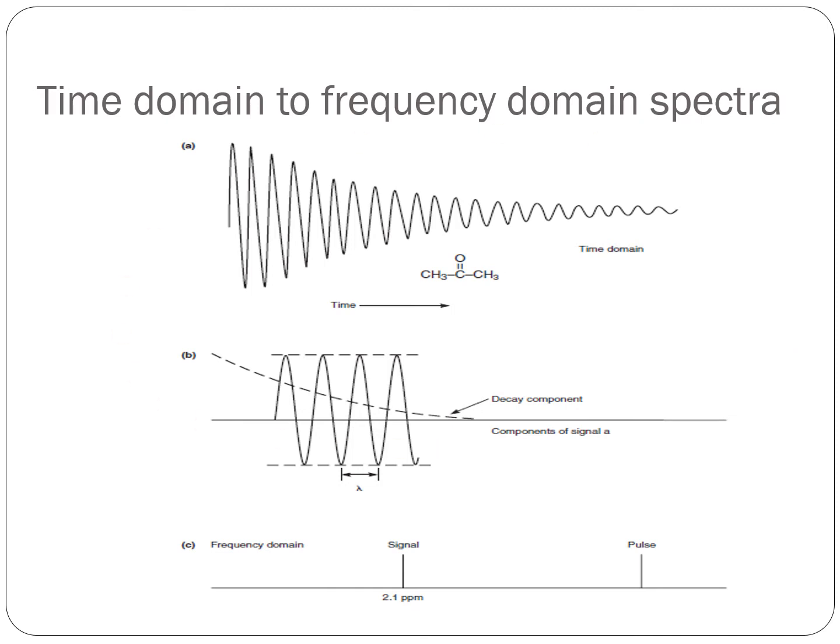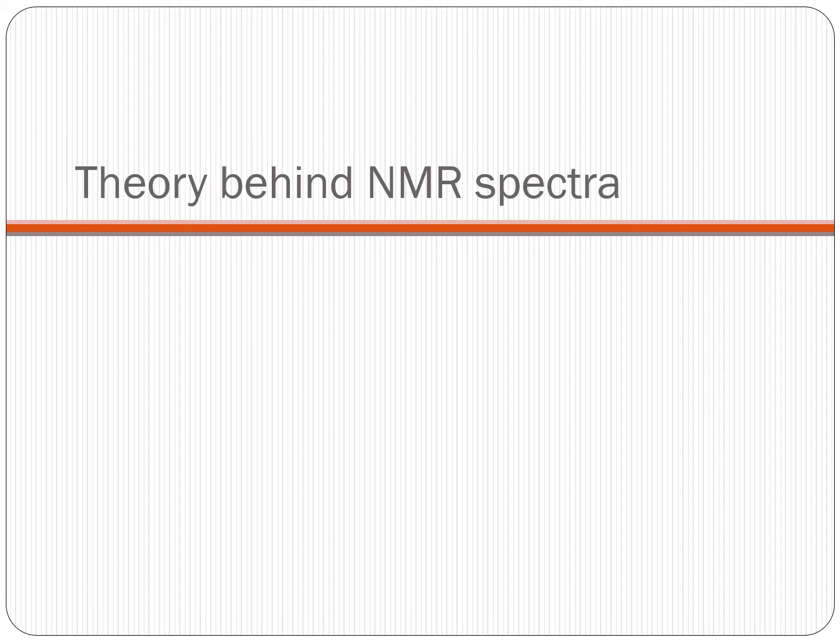But before going into this detail, I would like to share some theory behind NMR spectroscopy. So first of all, how can a nucleus be excited? Nuclei present in a molecule will be revolving around themselves with some momentum.